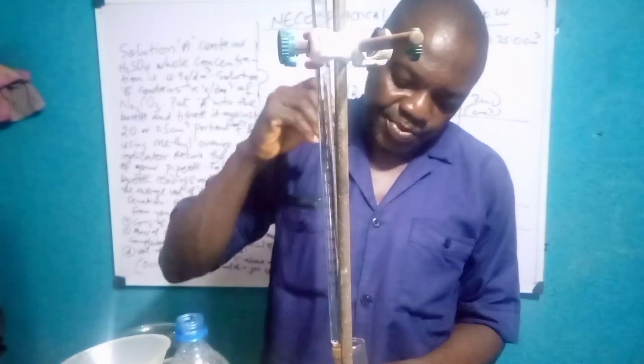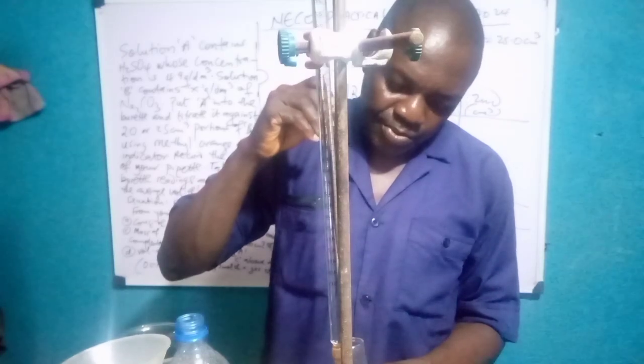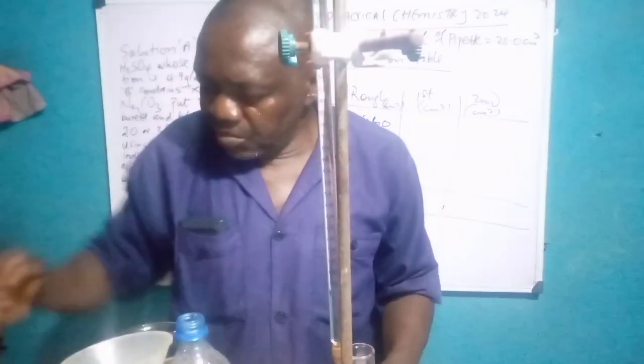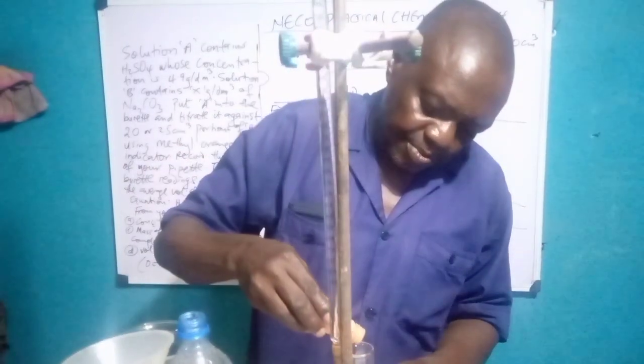Still draining through. Then we'll now add the indicator again. 2 drops.